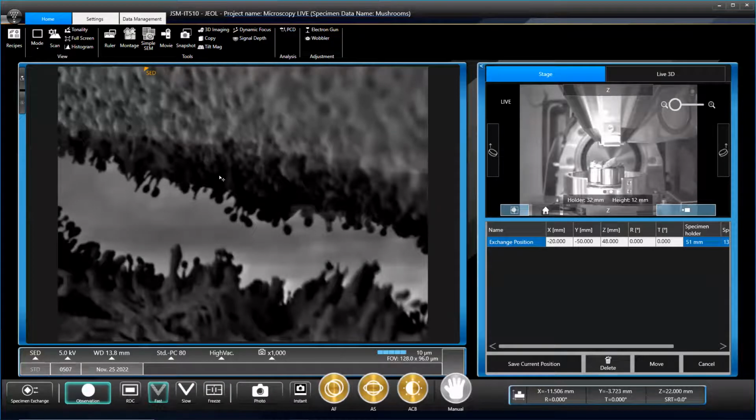It must be hard to know which way they're going. I think you're going the right way. The top left is. Because there's a bit of charge, it's never going to be perfect, because we'll be warping the signal. A fun little alien landscape though.